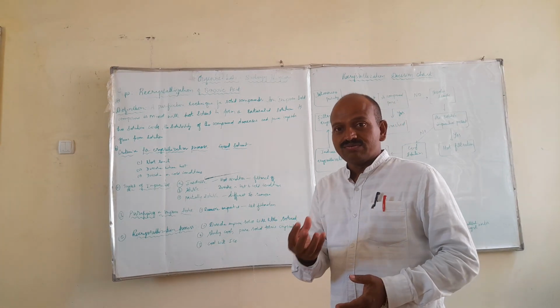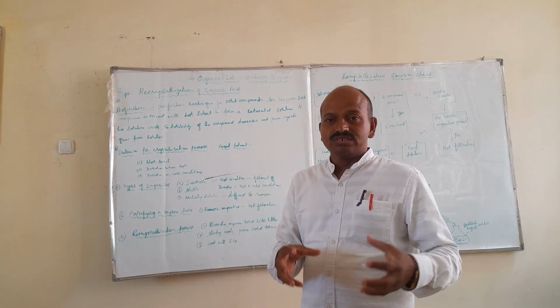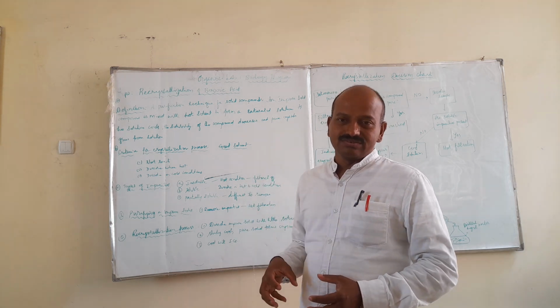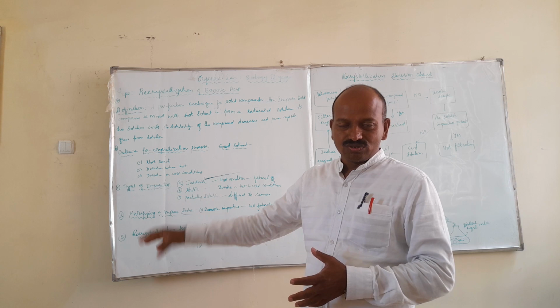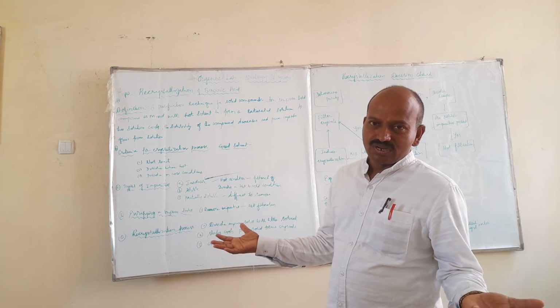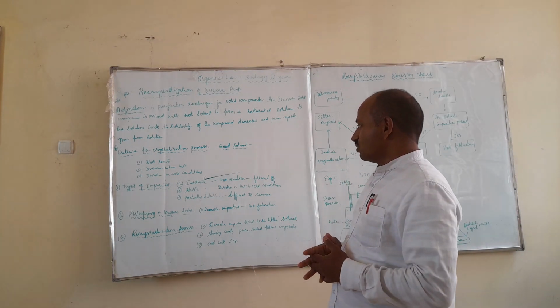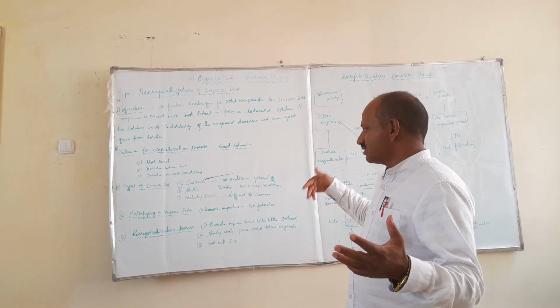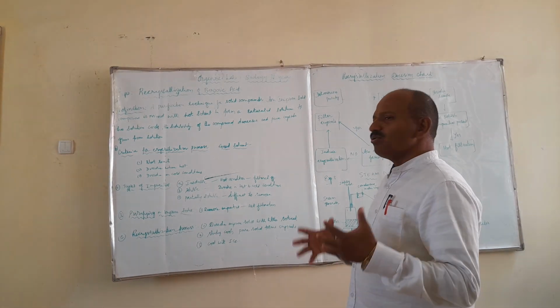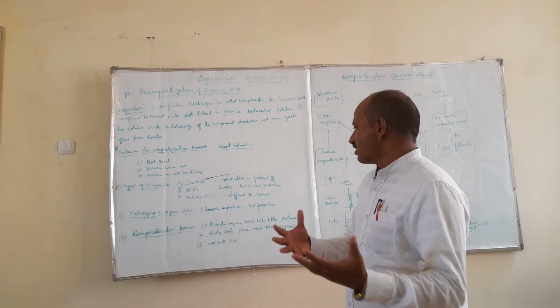The sand can be removed by filtration. The remaining sugar, which is dissolved with the benzoic acid, stays in solution when cooled with ice crystals, and pure crystals of benzoic acid are formed. The remaining solution, consisting of sugar, can be discarded, and the crystals are the pure crystals of benzoic acid. This is called the recrystallization process. Purifying an impure solid like benzoic acid can be done by the hot filtration method.